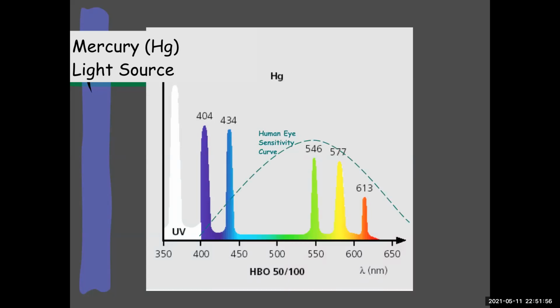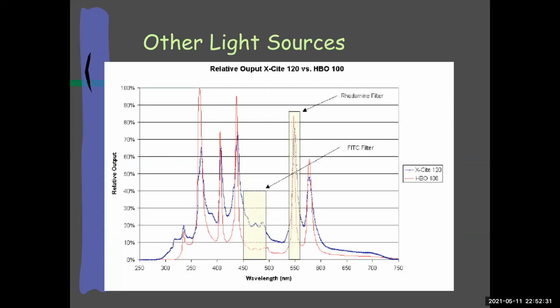And this is just showing you that your eyes are pretty good at greens and yellows and things like that. They're really not good at blues. We're actually pretty good with reds too. We don't pick up on the blue. The blue is going to look really dim to us, even though it's actually quite bright, both in the arc lamp, which you're not looking at obviously, but this is just a reference, but also when you're looking at the fluorescence itself, like, is the lamp on, do I see anything, is it coming through? Or you're looking at your specimen, just know that about your own eyes.